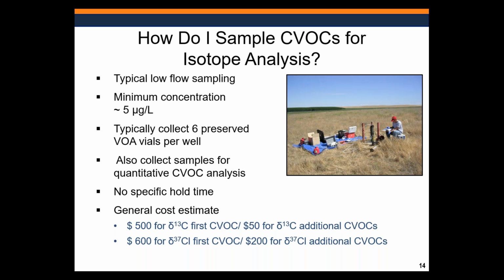The lab will typically want to know the concentration of each VOC in the different groundwater samples. There is no specific hold time, but labs, including MI, turn these around pretty quickly these days. This is a pretty routine analysis.